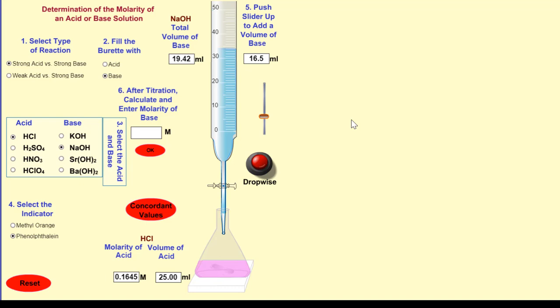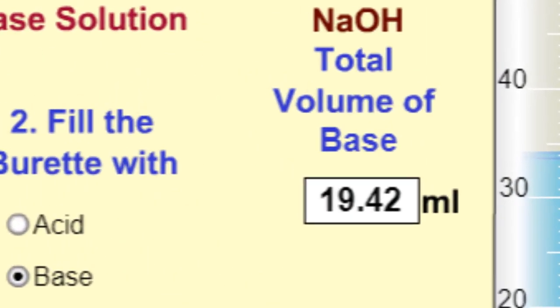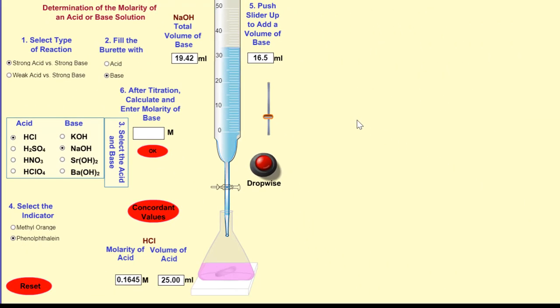I am at my end point. How much base did I use? I used 19.42 milliliters. 19.42 milliliters right there. So you are going to try to figure out what was the concentration of this sodium hydroxide that we titrated with. So we have 0.1645 molar of 25 milliliters of my acid. My base, I used 19.42 milliliters. What's my concentration of my base? That was lab number two.